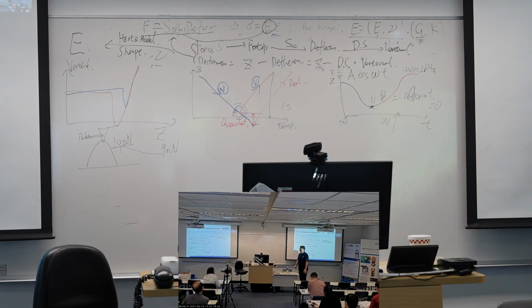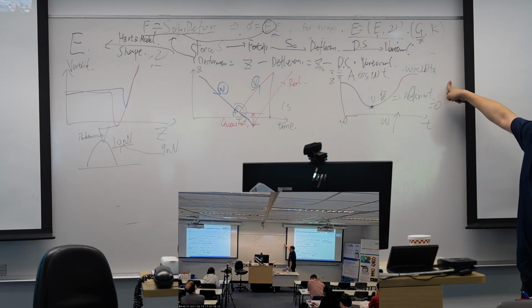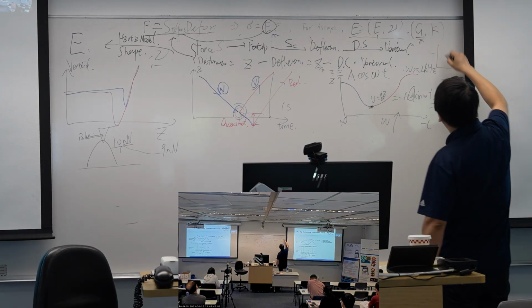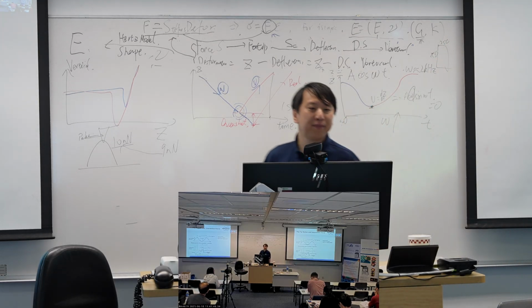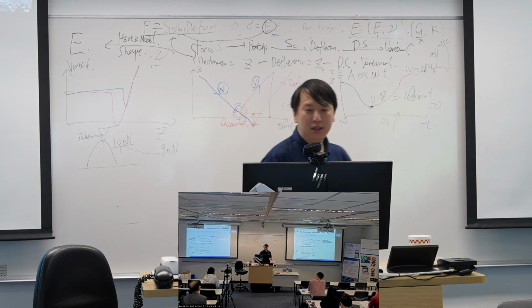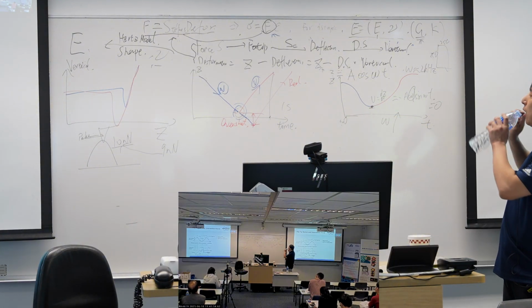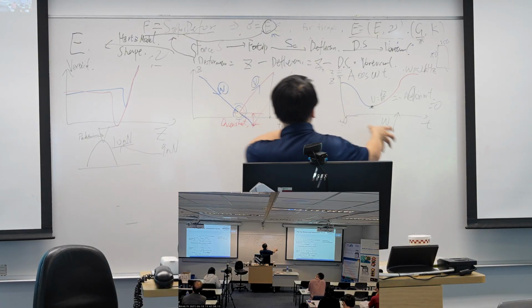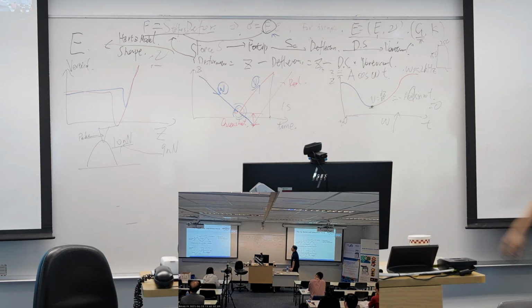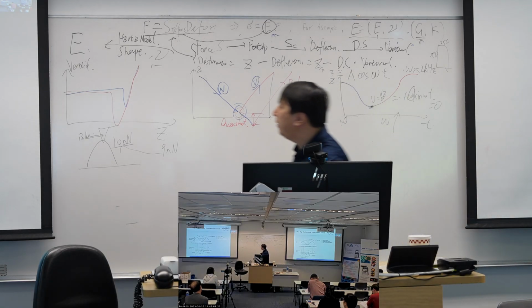The 2 kilohertz means you can do force curves 2,000 times per second. And then to capture 256 times 256 is around 4 minutes. That's acceptable, and that's the normal speed used in the normal AFM setup. Okay, that's the total idea we have for this tip motion. We are using a sinusoidal movement.